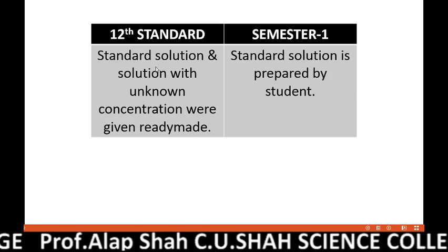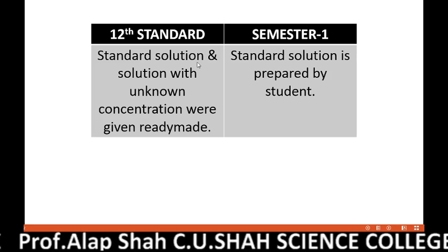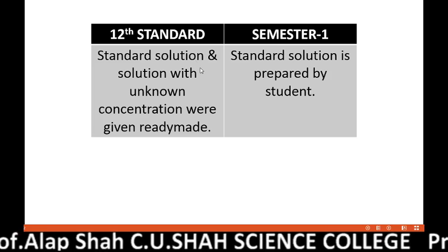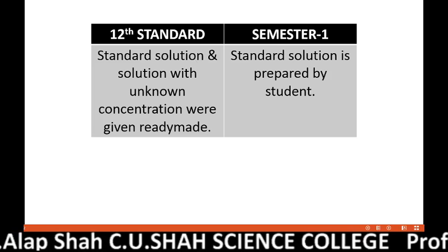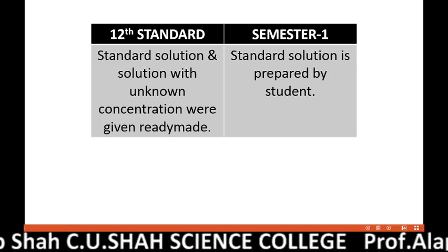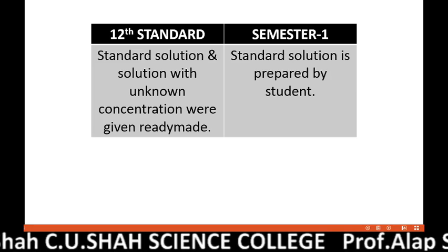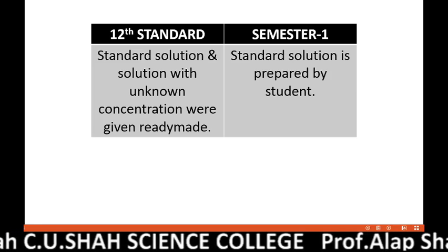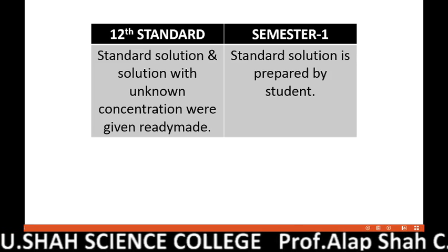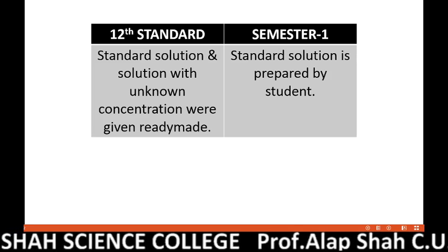What is the meaning of standard solution? A solution with the known concentration is called a standard solution, and the solution with the unknown concentration, whose concentration we want to determine, is called the unknown solution, or we call it X normal solution. So both these solutions were given to you ready-made.